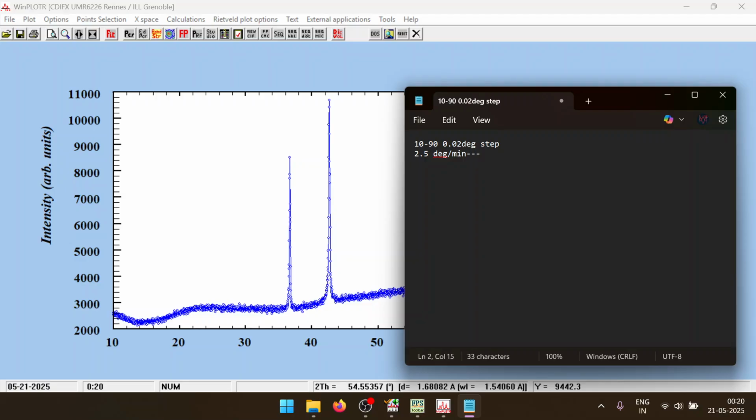So this goes around 30 or 34 minutes per scan or per sample. This is the least setting that I can use. It is not a very good setting, but it is the entry point of refinement.